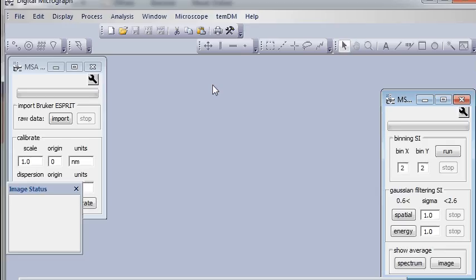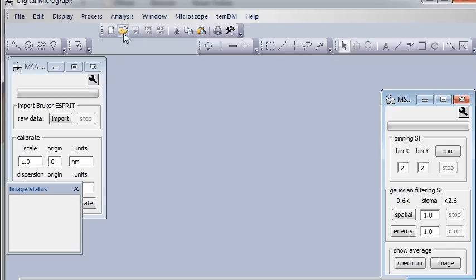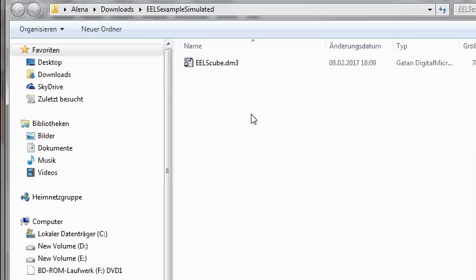Well, now probably it's good to show you a simple example of an object to be treated. Remember, I told you about some EELS example. I already downloaded that and unzipped it. So now let's open it.